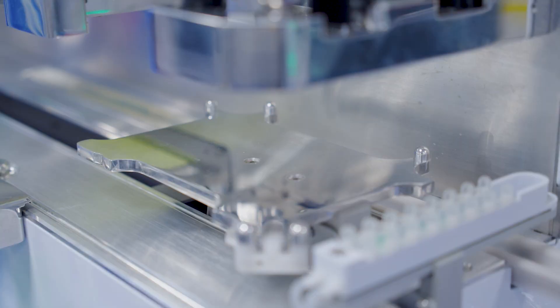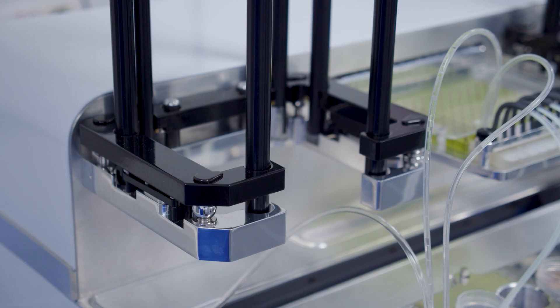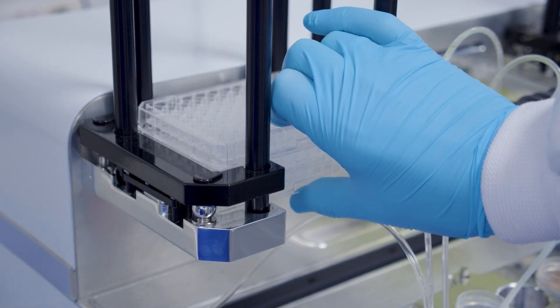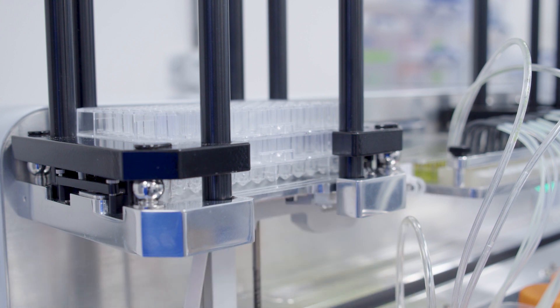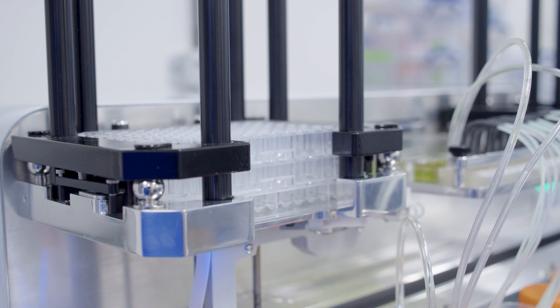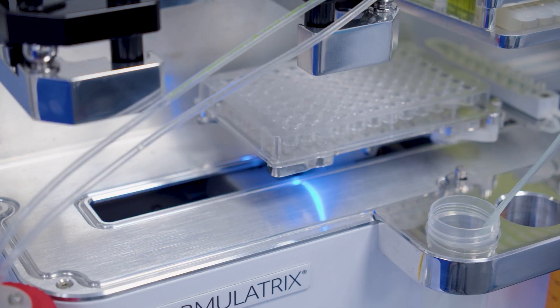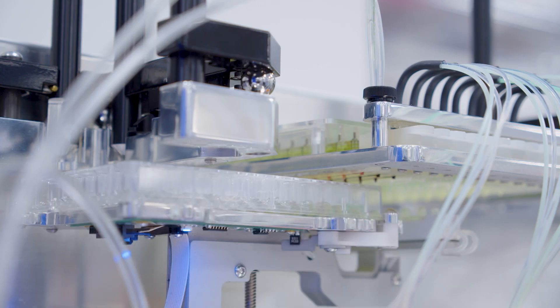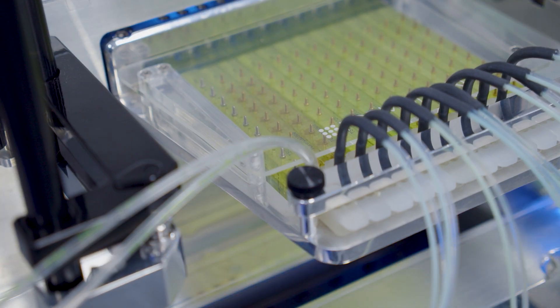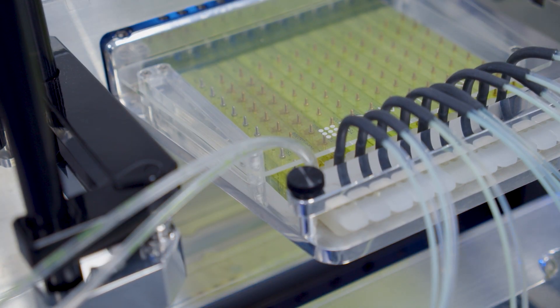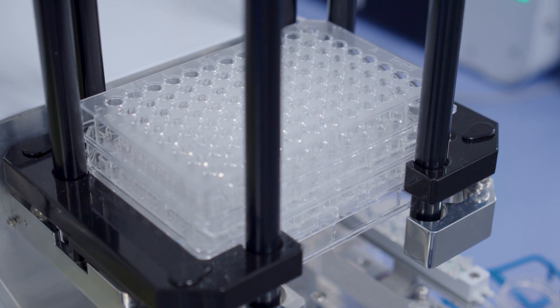The Tempest is usually equipped with plate stackers, each able to hold up to 24 SPS plates. This means a single protocol can fill many plates, either as replicates or as different combinations of liquids, and it can even do this across different plate types.